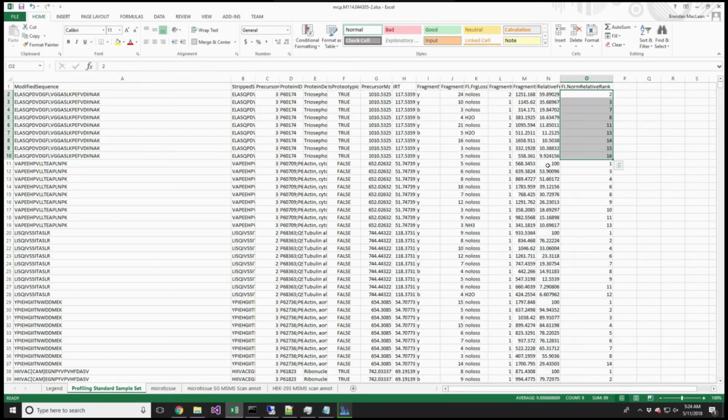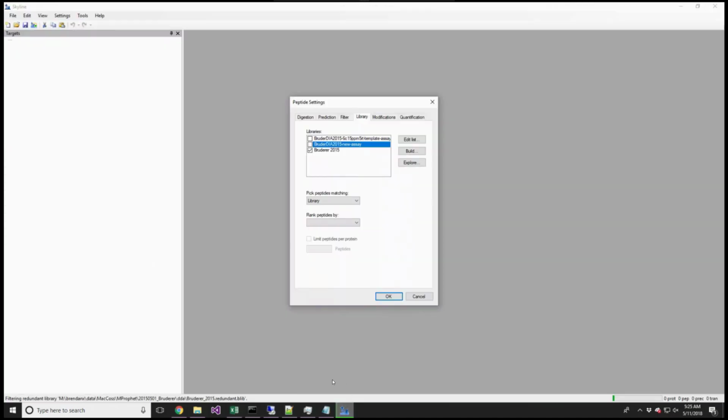So there's a lot of choices that have been made upstream, and I guess you can read the description of how they did this. I don't think it's as detailed as they're telling you this necessarily, but to me, these assay libraries are like the Skyline document, right? And you're losing the actual library that just has all the spectra without any choices made. So that's what we're trying to capture here in Skyline. Wow, and I guess filtering this takes a long time. So we'll come back to that later today.